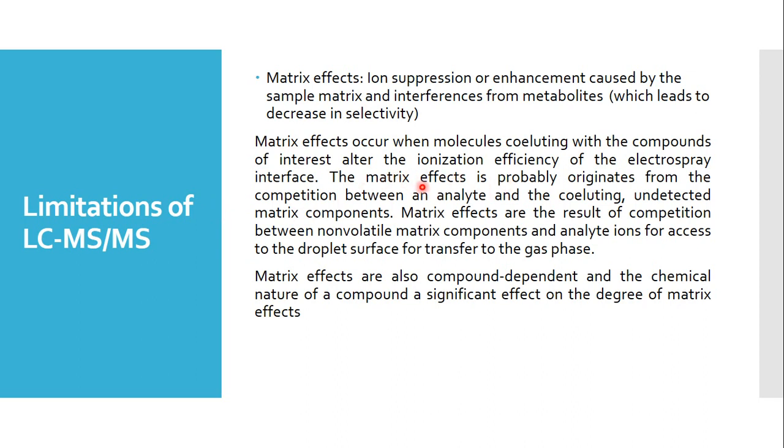This matrix effect originates from the competition between the analyte and the coeluting undetected matrix component. These are the result of competition between non-volatile matrix component and analyte ions for access to the droplet surface for transfer to the gas phase. Matrix effects are also compound dependent, and the chemical nature of the compound has a significant effect on the degree of matrix effect.